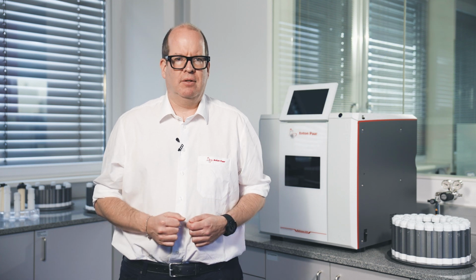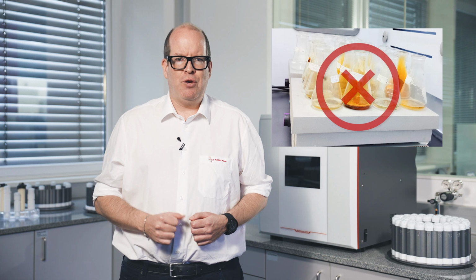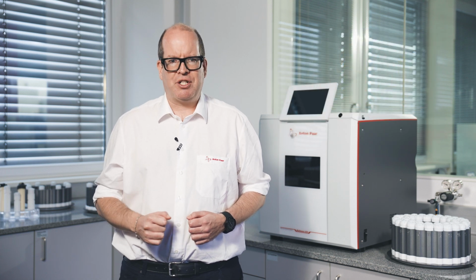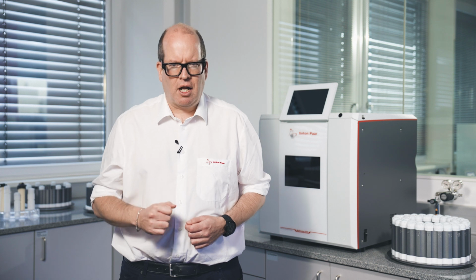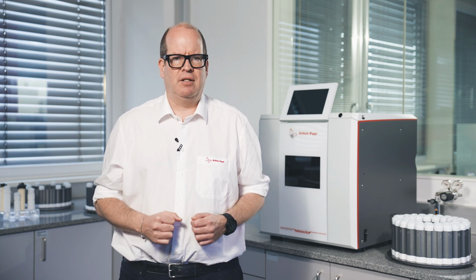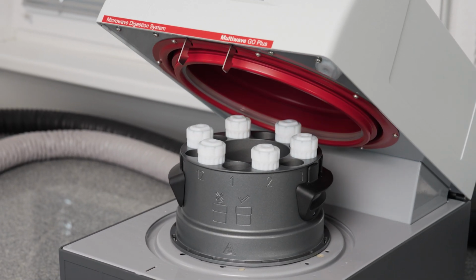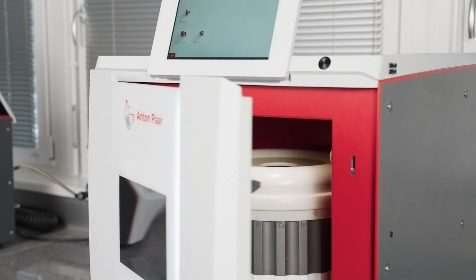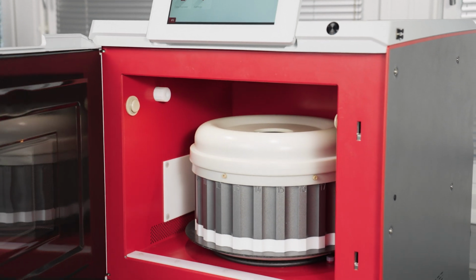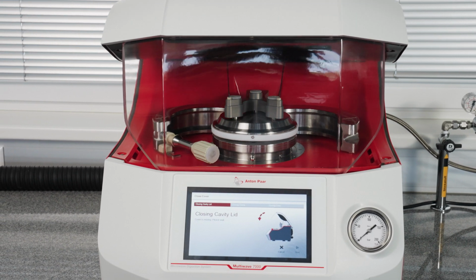How do I reach such high temperatures, you may be wondering? Well, a hot plate isn't going to be enough. You need to close the vessels, otherwise the acid will evaporate upon heating. But heating a closed vessel to a high temperature will also result in high pressure. And for that, you need special instruments that can heat to and withstand high temperatures and the built-up pressure, which can reach up to 200 bar.